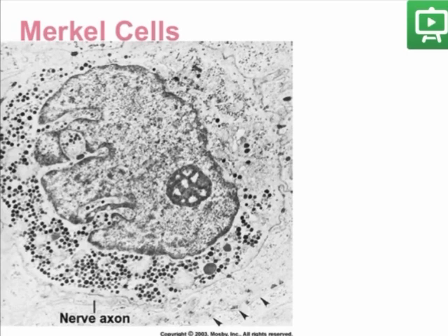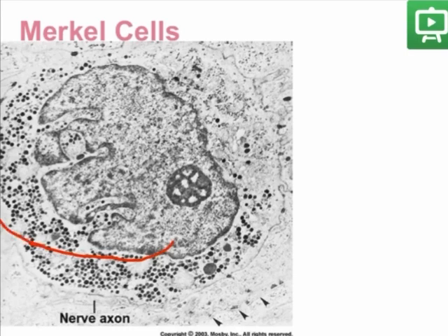Merkel cells are non-dendritic cells. They are often closely opposed to nerve fibers, as seen here, because they act as receptors for sensory function. These cells are often seen deeply invaginated and many small vesicles can be seen close to the nerve fiber.